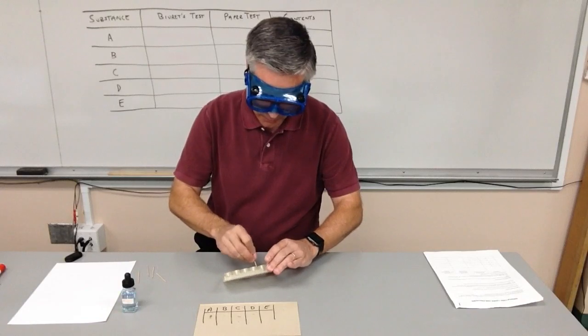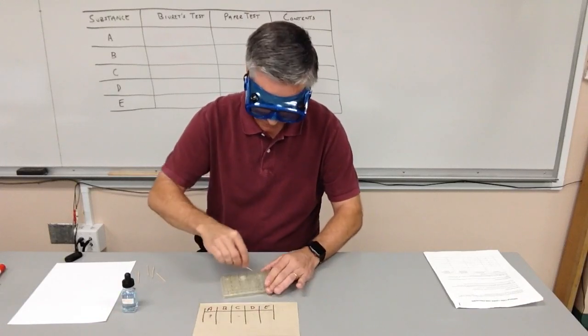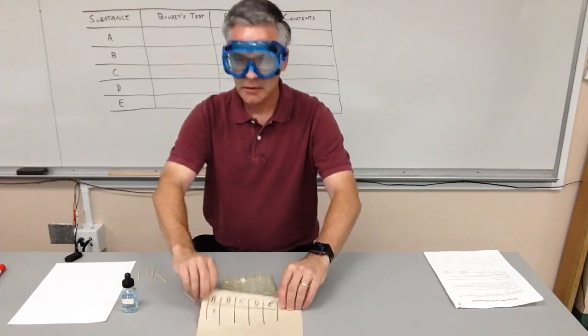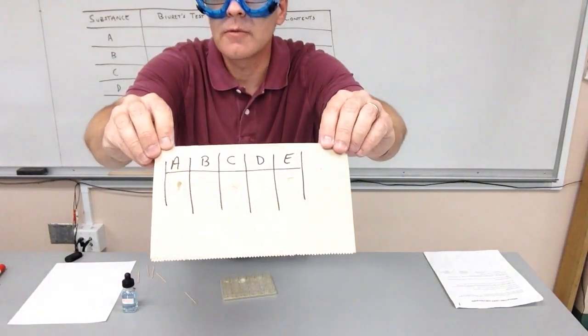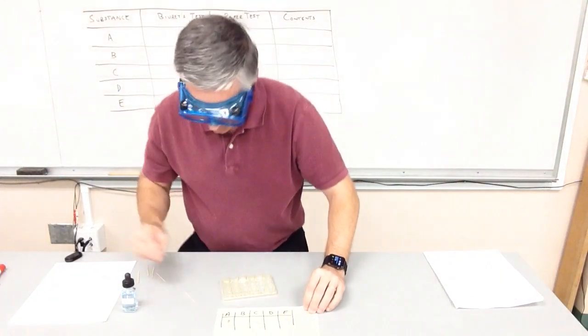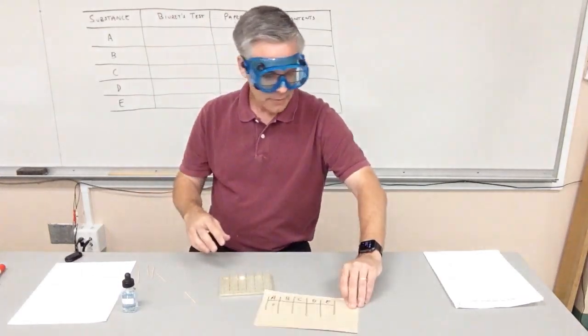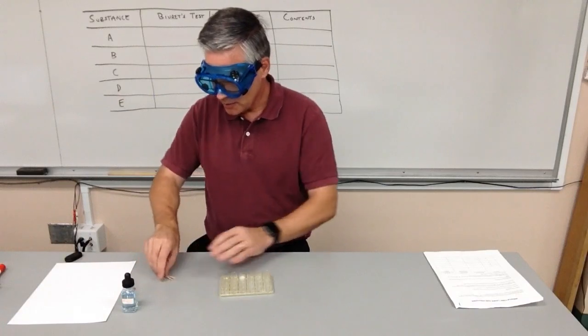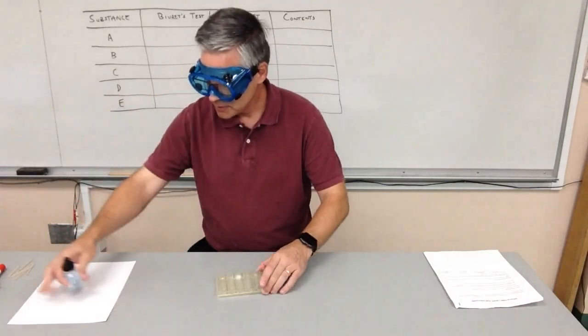And then some of it. And so hopefully, I don't know if you can see, there are little wet marks on each one there. I'm going to put that off to the side, and we would normally just let that dry by itself. And then I would go ahead and get rid of my toothpicks because I really don't need those anymore.